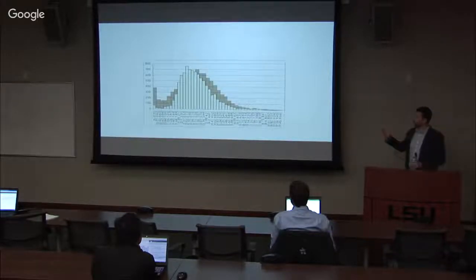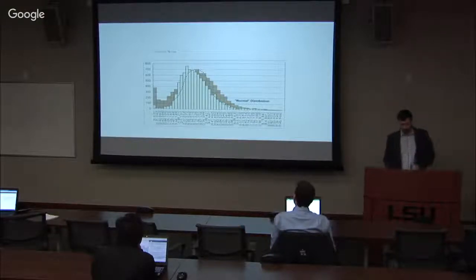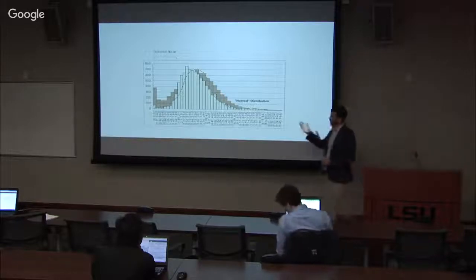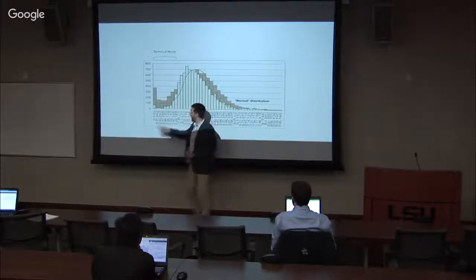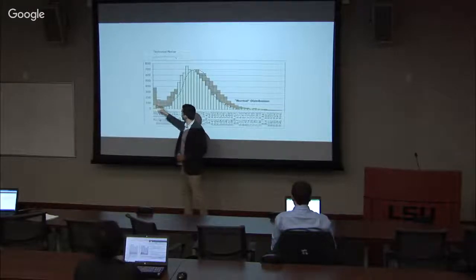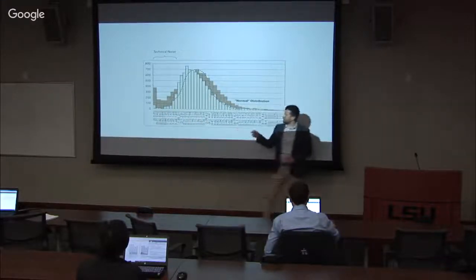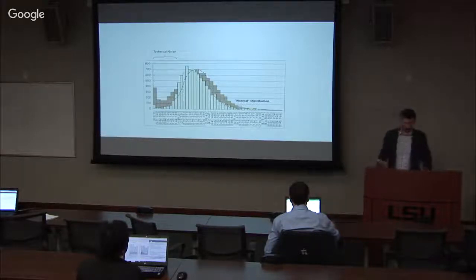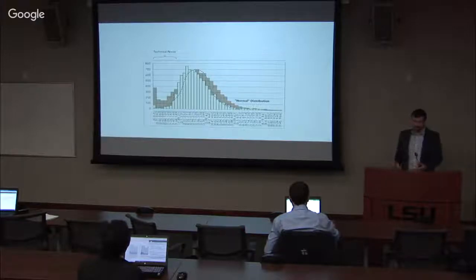So if we overlay one sample on the other, just in terms of their histogram, what we can see is that they are different from the normal distribution. And if we want to take a look at differentially expressed genes, a lot of genes are going to be differentially expressed, right? All of these are going to be differentially expressed. But the question is, how believable is it that they actually are? Because they're such low values, it's actually indistinguishable from noise. So you cannot rely on them. Just randomly doing different sequencing techniques, different machines, you will get a lot of this variation. So that is not what you want to pay attention to.